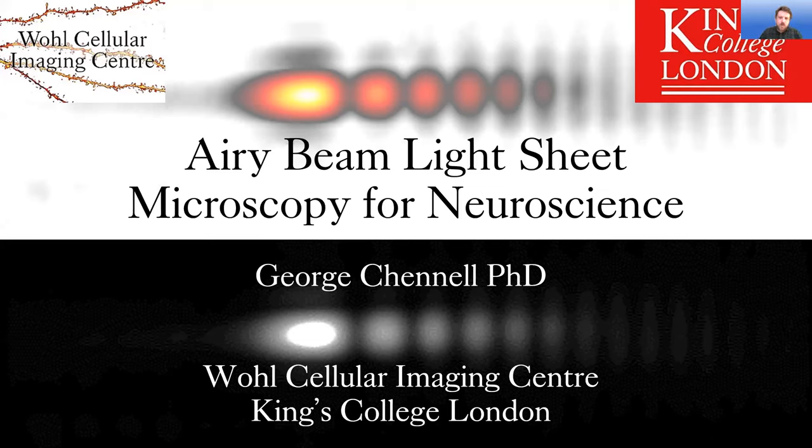So I'm going to give a talk today about some work that we've done with the Airy beam light microscopes that we've got. These are some systems that are quite novel, and some work that we've done with it is quite exciting to show you. So I hope you find it as exciting as I do.